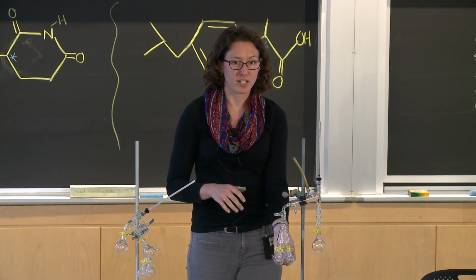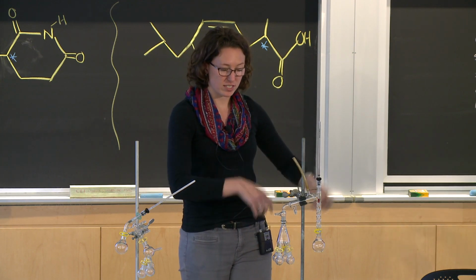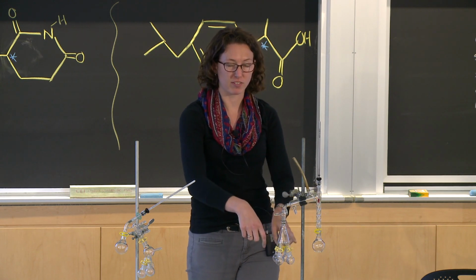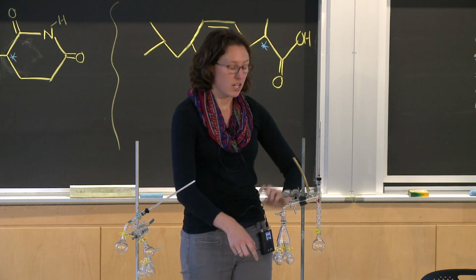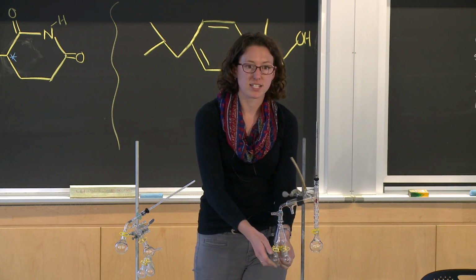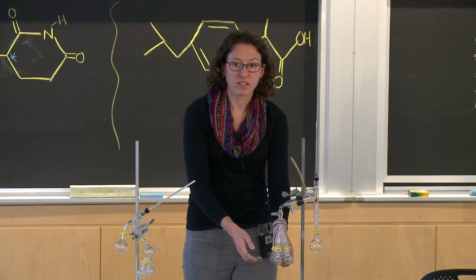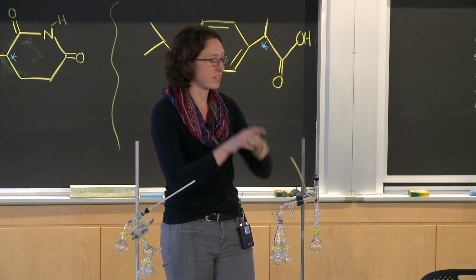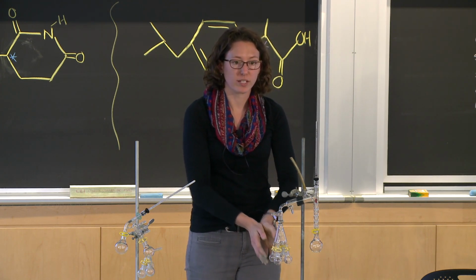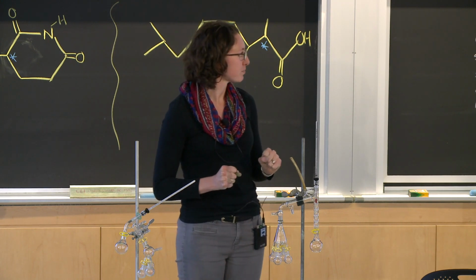what you've already collected as pure product to revaporize and go back into your system, and you don't want these to evaporate and then recondense into each other and contaminate the fractions that you've worked so hard to collect. So you're going to have to engineer your ice bath to only cool one flask at a time, especially the limonene fraction. That one tends to be very volatile, so your TAs, again, will tell you about this when you get to lab, but you want to make sure that you are cooling your fractions but not cooling too many of them so that you don't get spillage into different vessels.